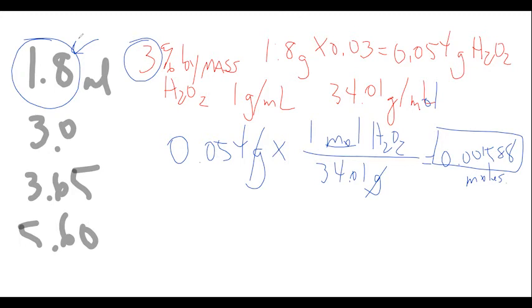So when I get to the calculation of R, I'll round to 2 significant digits, but I'm not going to start rounding first. That's a way of introducing a lot of error that you don't want, because you're changing the information before you do your calculations, so you're starting with impaired numbers.